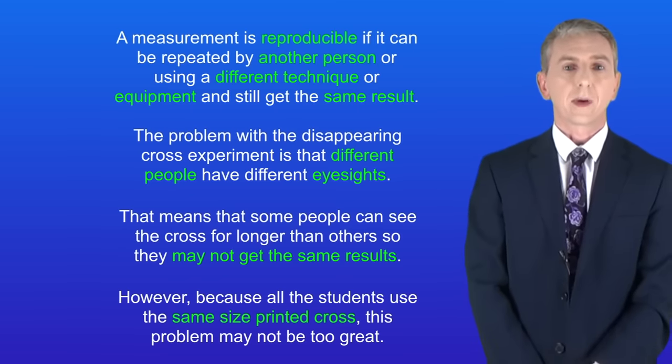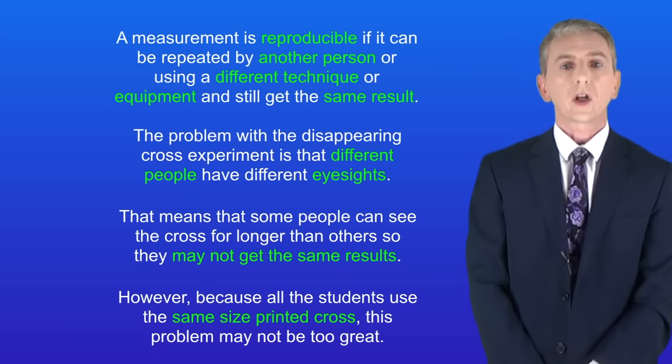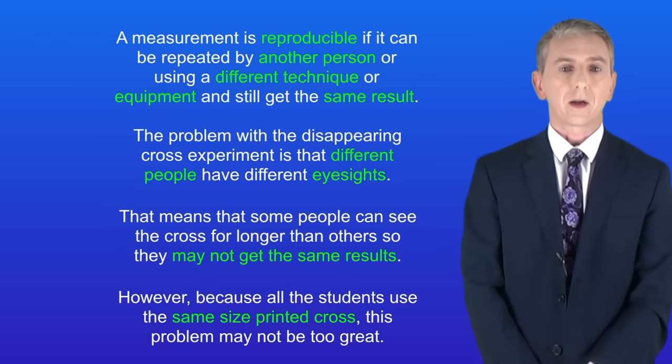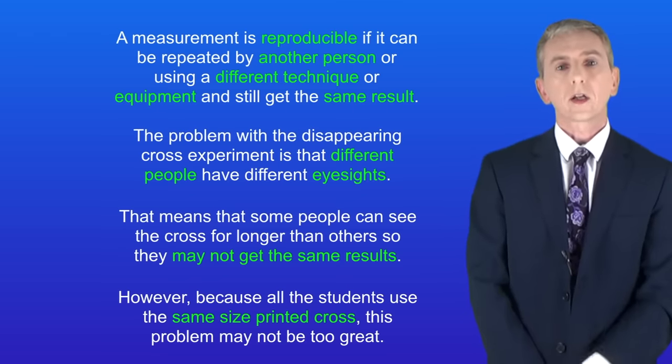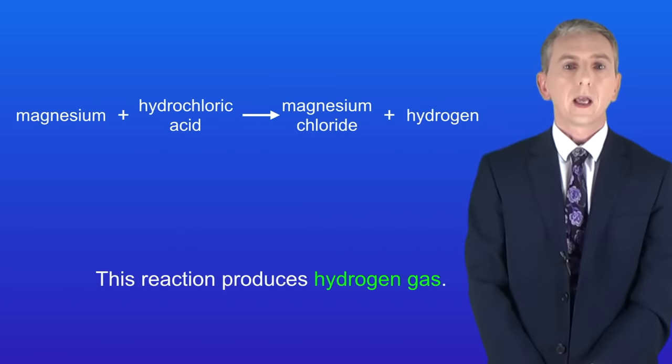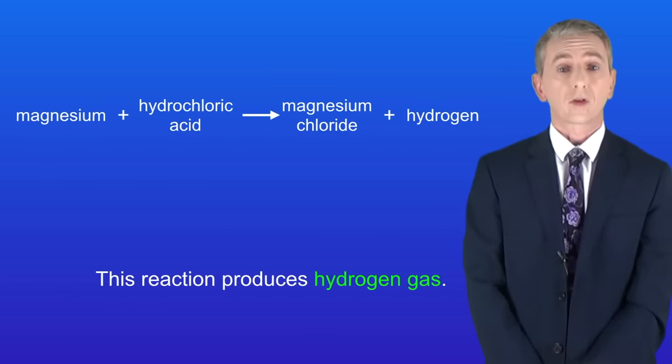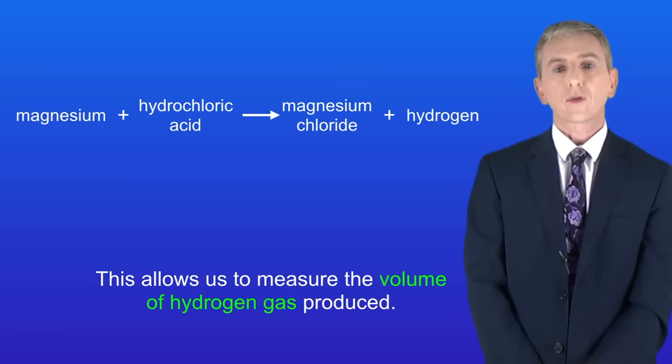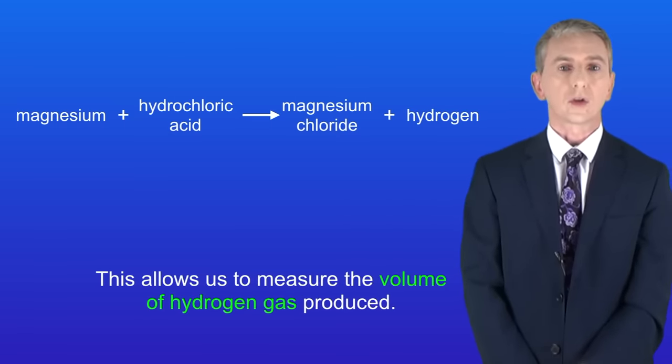We're going to look now at the second method for this required practical. We're going to measure the volume of a gas produced by a reaction. Here we're reacting magnesium with hydrochloric acid. This reaction produces hydrogen gas and this allows us to measure the volume of hydrogen gas produced.